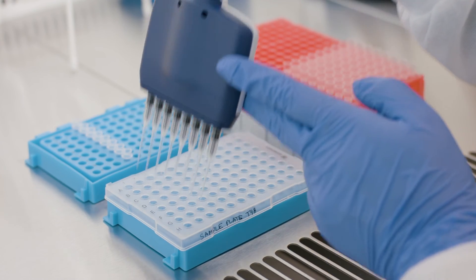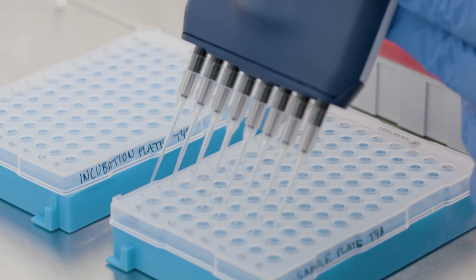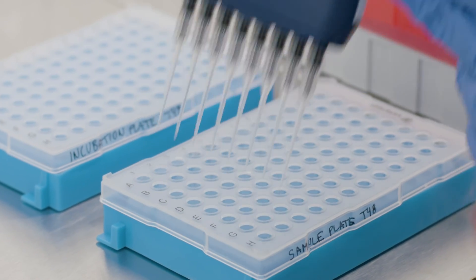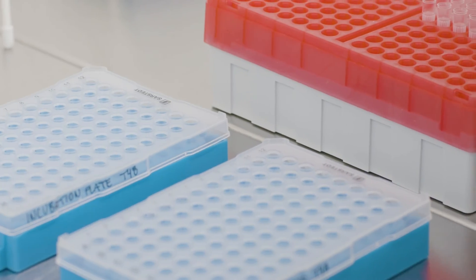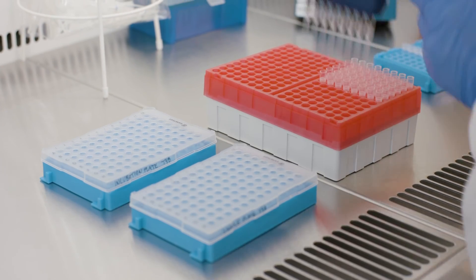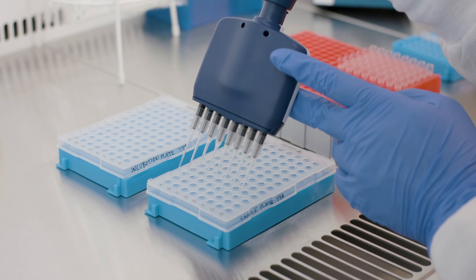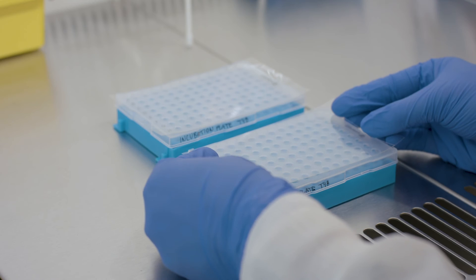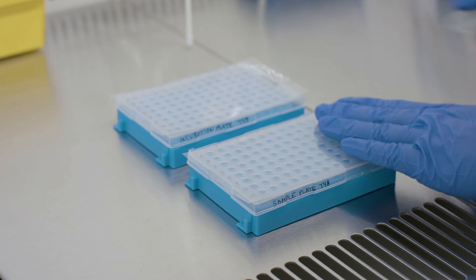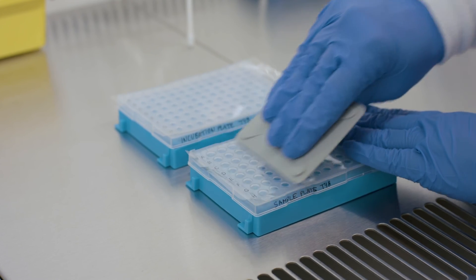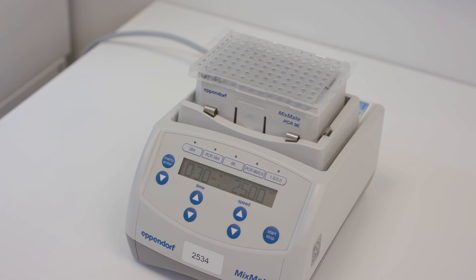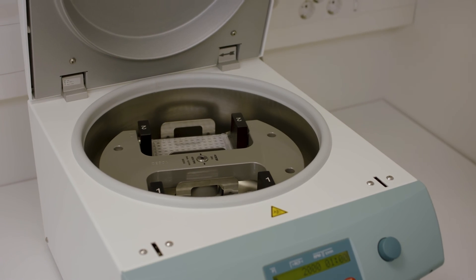Transfer 7.2 microliters of the detection mix to each well of the first 6 columns of the sample plate by using reverse pipetting. Transfer 2.8 microliters of the extension PCR products in the incubation plate to the sample plate using a multi-channel pipette and forward pipetting, changing tips between each column. Seal both the sample plate and the incubation plate with adhesive plastic film. Vortex and spin down the sample plate before proceeding.